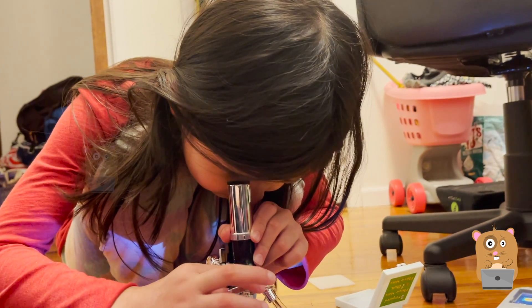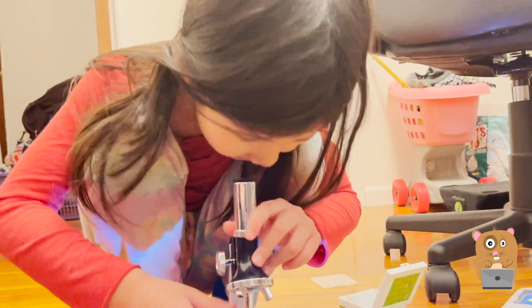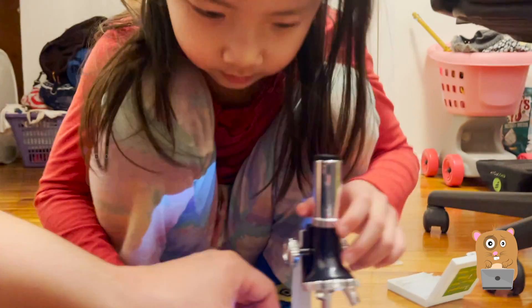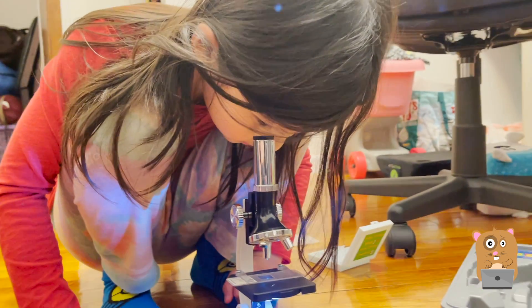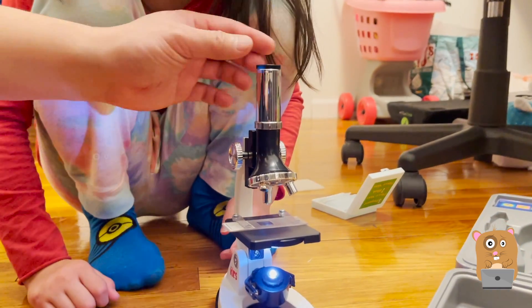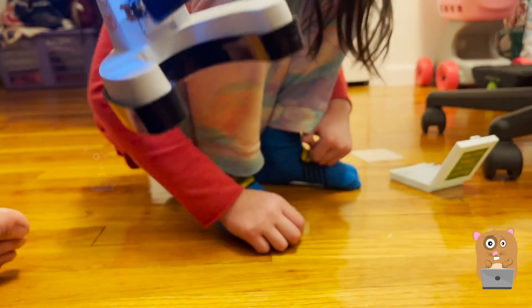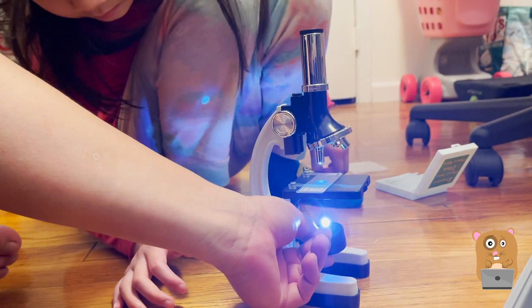Do you see anything? It's just the same thing. No, they're all different. Except this one just has more dots. See this dot thing? It has to be right in the middle of the glass. Yeah, it's the same thing but with more dots. They all have different patterns, Kevin. I kind of like it though. You can also adjust the light on the bottom. You can adjust the light. Make sure it's aiming properly. Oh yeah, it's better.